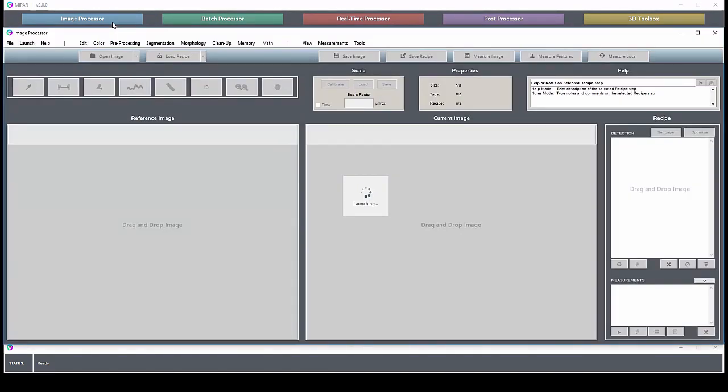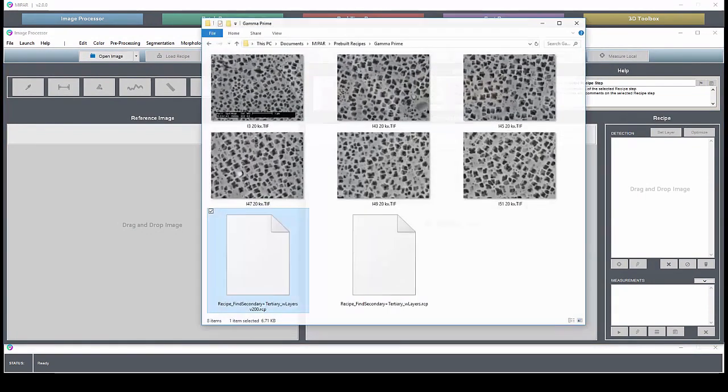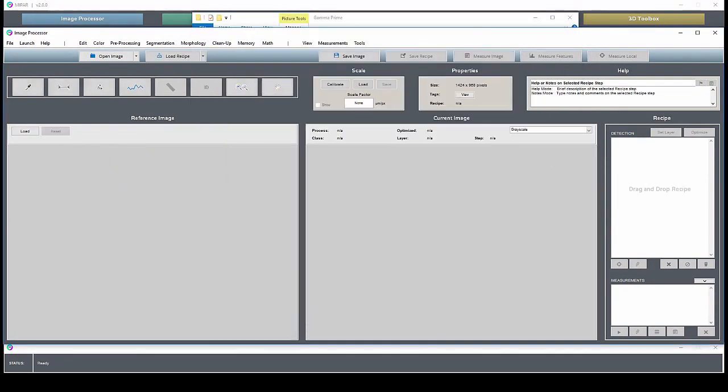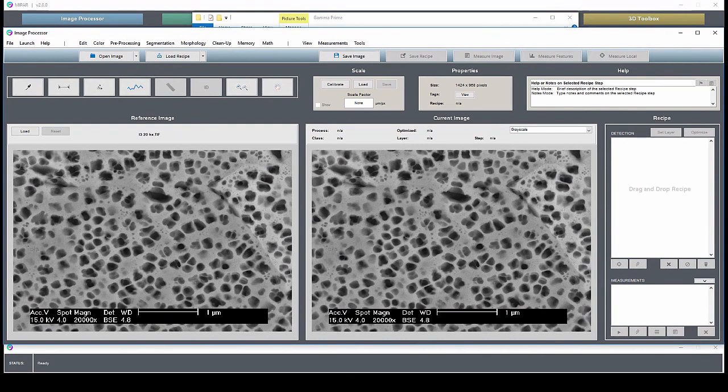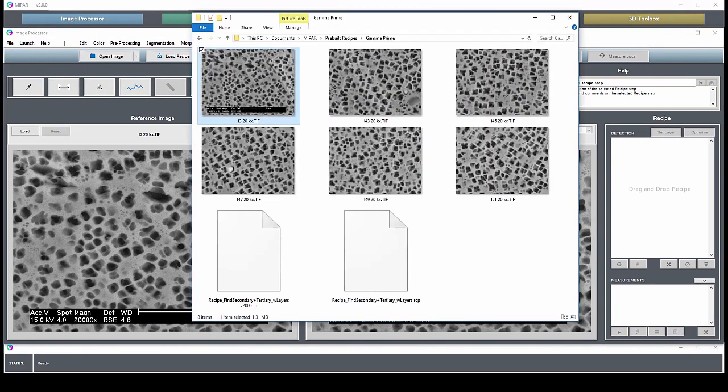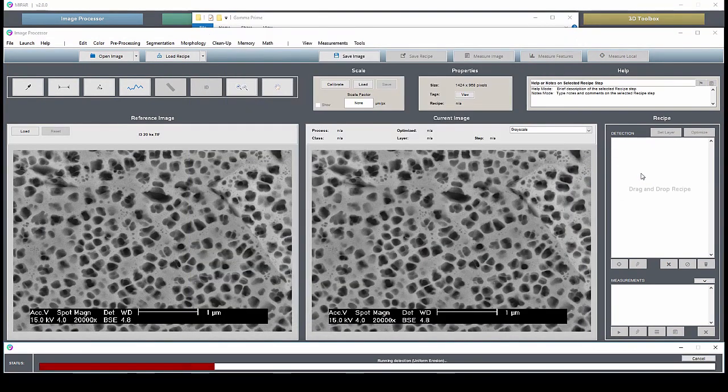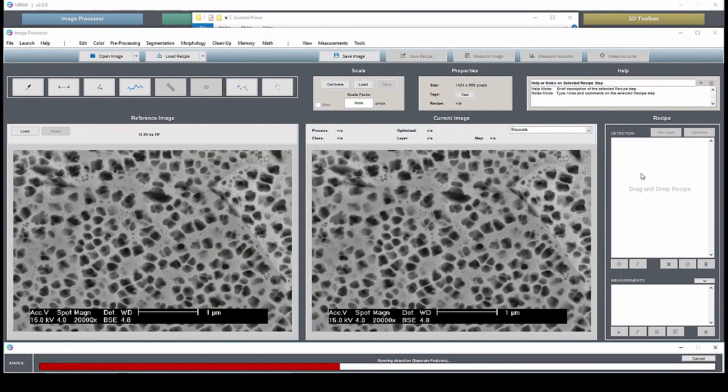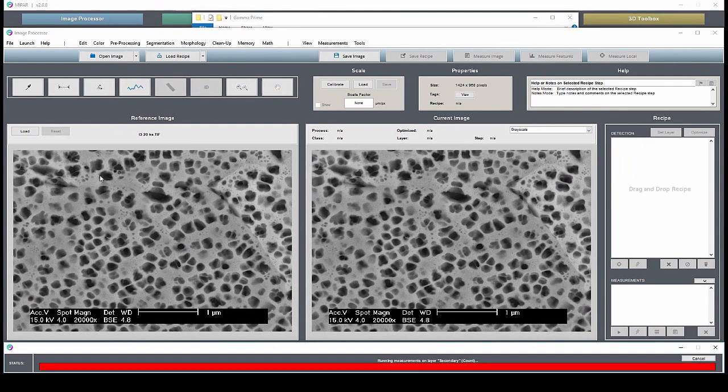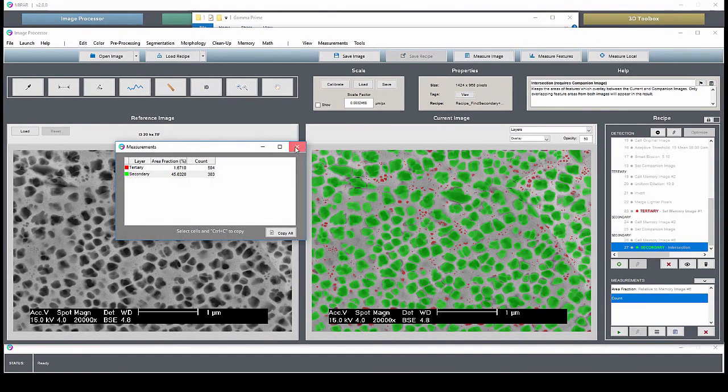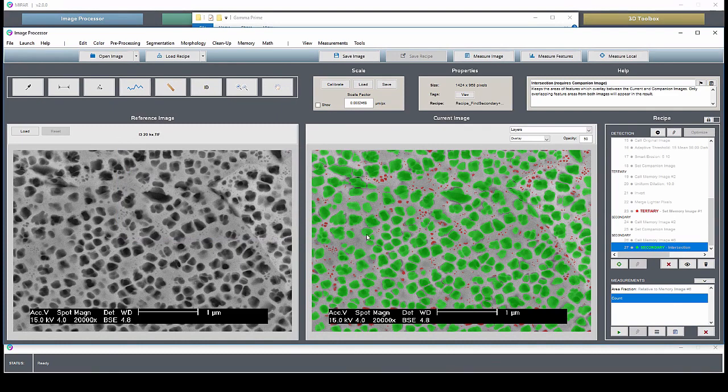Let's zoom into the image processor now. As I mentioned before, this is the place where you'll develop and edit your image analysis solution. Opening images in the image processor is almost trivial. Just drag them in. You can do the same with the recipe. The original or reference image lives here on the left, while the current processed image lives on the right.